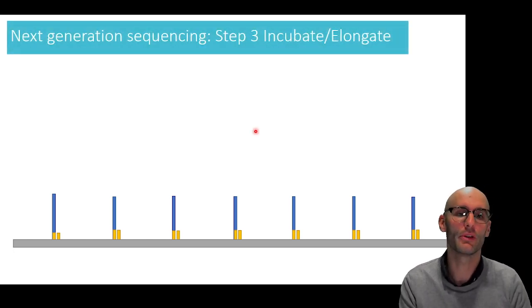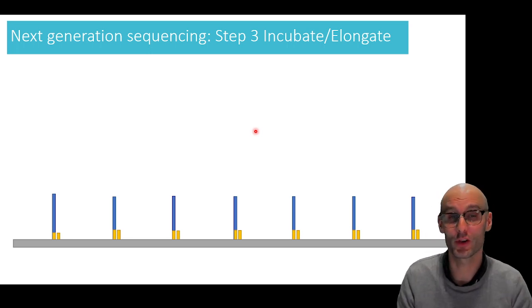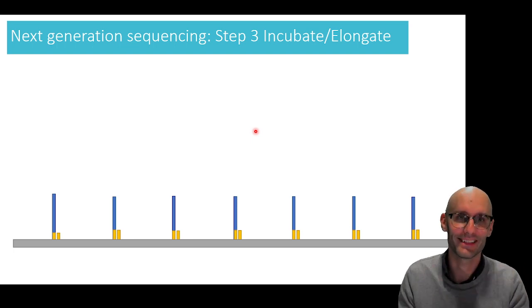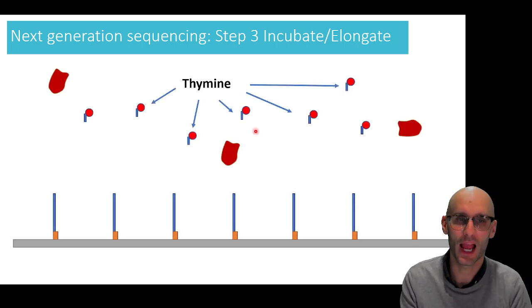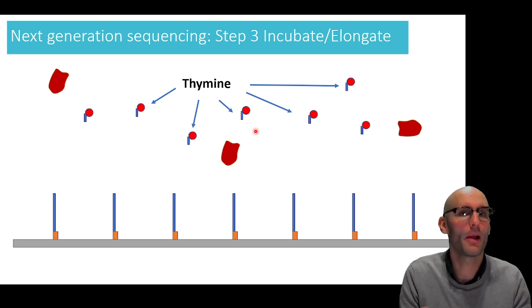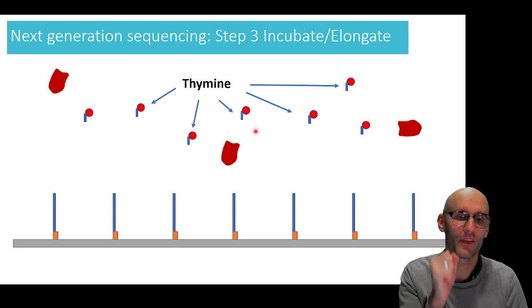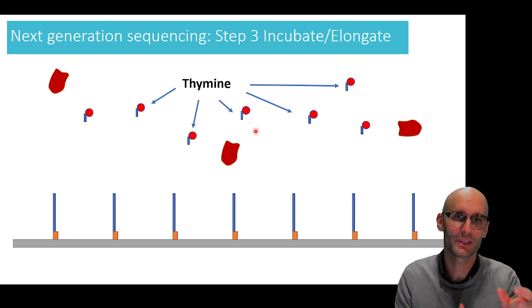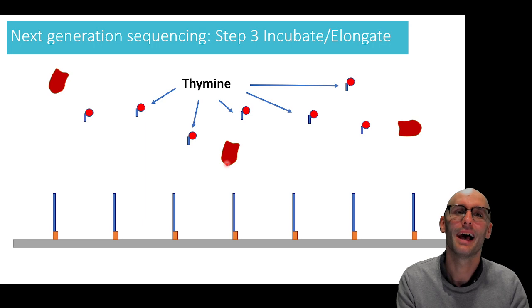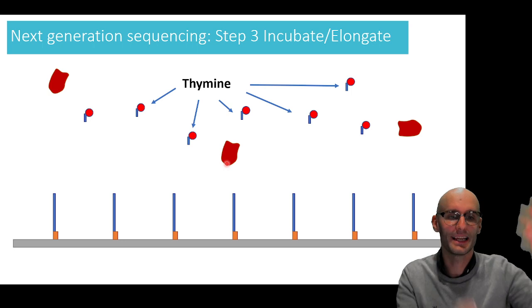And now what we're going to do is incubate and elongate it. So we're going to essentially wash solutions over the top of the glass slide, which will elongate the DNA, and we'll make recordings as we go along. You'll get what I'm talking about here. So for example, we might incubate it in thymine. It'll actually be deoxyribothymine, so it'll be a little nucleotide. So we're now putting in the thymine nucleotide, and we have put a red fluorescent tag in it. We've also put in a DNA polymerase. That's the enzyme that we need to attach nucleotides to the DNA to extend it, okay?